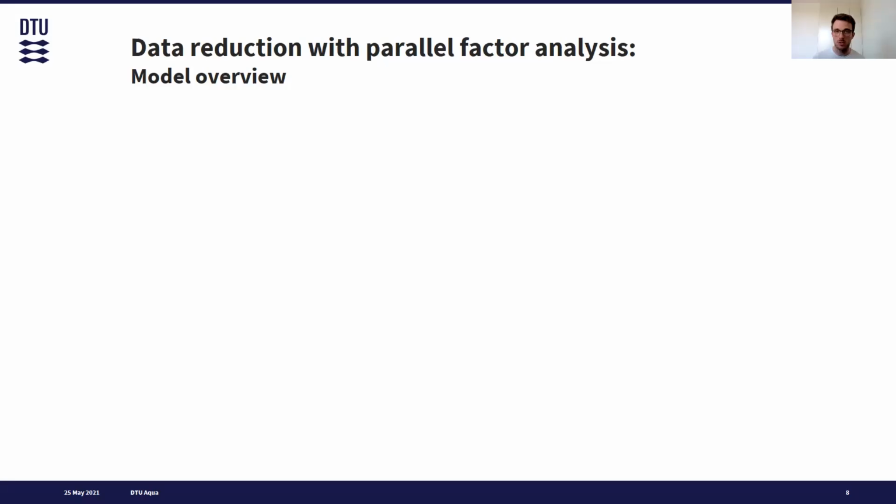So this was, to my knowledge, the first time that a parallel factor analysis model was applied to a data set like this. We weren't quite sure what to expect, if it would work, and how many components you would need, because typically we would assume that this is a very complex data set. So we might even need something like 50 components or even more. And we would maybe have to slice the chromatogram into separate fractions to describe them in separate analyses.